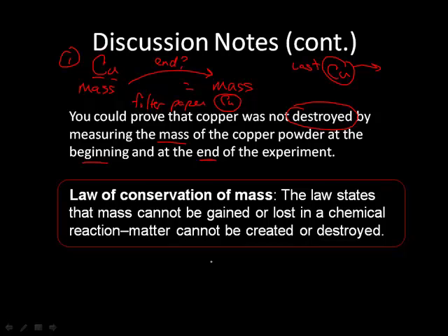Now, little amounts of copper were lost along the way. This could have been because of spills or measurement errors or the copper getting stuck on filter paper or even in the beaker. Right? We had to clean up a little bit. Nevertheless, mass is still conserved. Even if the original copper didn't end up in the beaker at the end, it exists somewhere.